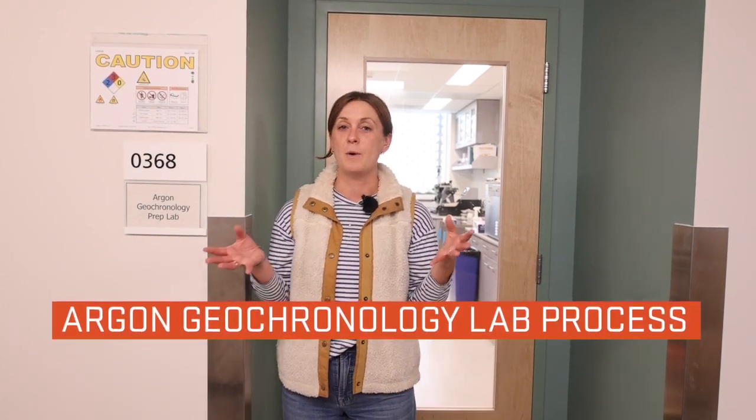Welcome to the Argon Geochronology Lab. Geochronology is just sort of a fancy way of saying that we date rocks, and we date rocks from samples all over the world. When we first get a sample, we crush it, and we do that in the basement.